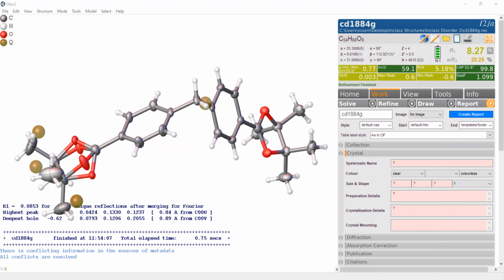I forgot to write the values down, so we'll just put some values here for now, 0.3. I have them written down somewhere, but for this exercise, we'll just put them in.